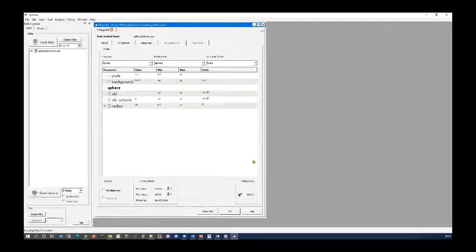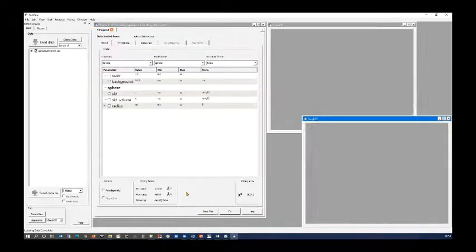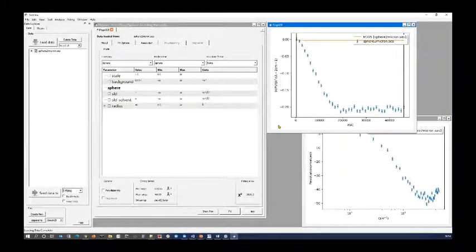Okay. But if I plot the data now, rather than getting intensity against Q, I'm getting a normalized polarization as a function of spin echo length Z. Okay, and this is a major difference between SANS and SESANS in that SESANS works in real space, which confers some advantages. There are a few disadvantages too, but it's kind of complementary to standard SANS. But I can fit the data in exactly the same way.